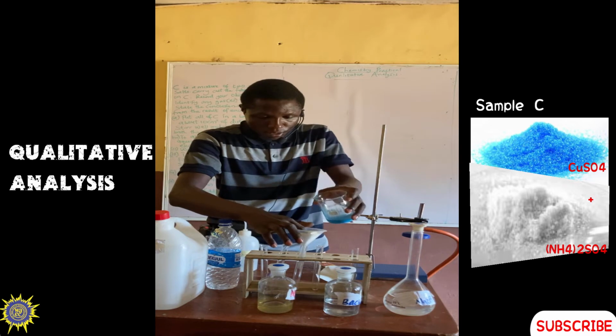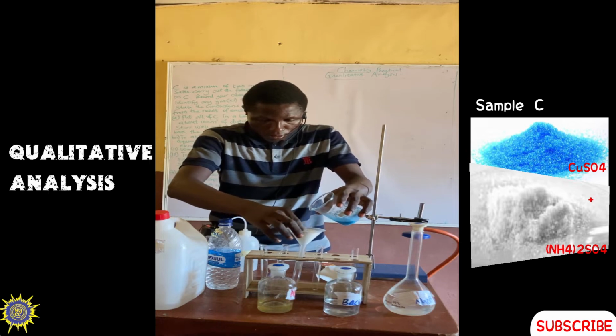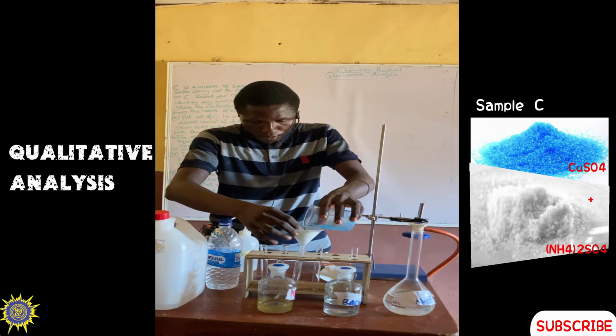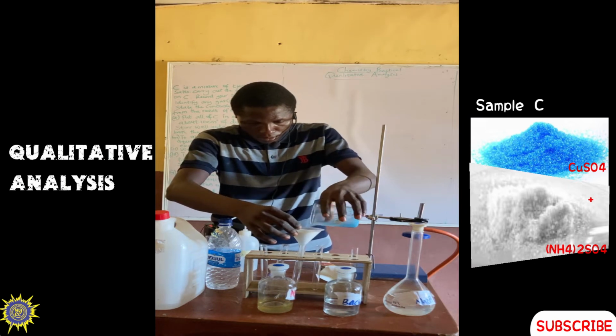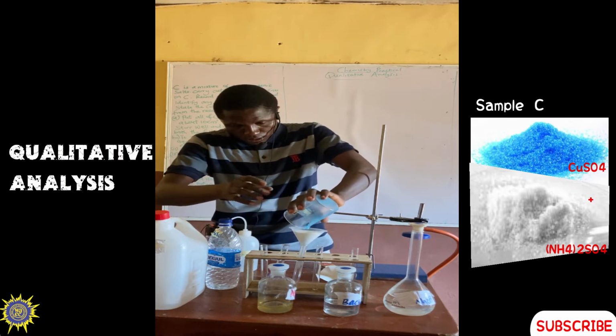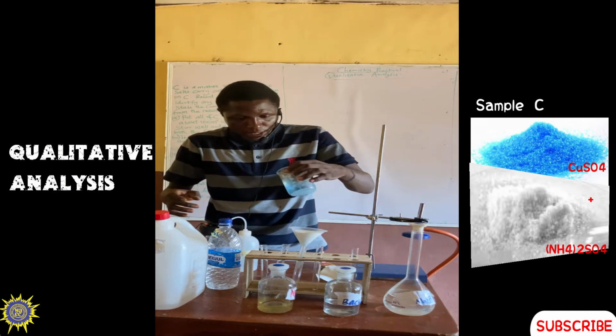Then you pour your mixture. So that's that.